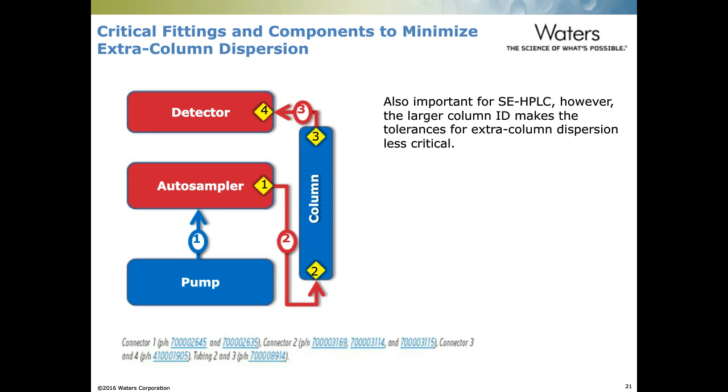On the other side, much like any other chromatography separation, we are concerned with the dispersion in the detector, as well as the quality of the connectors between the detector and the outlet of the column. So it's important to set these experiments up correctly and to make sure that our connections aren't adding any extra dispersion to our separations, to get reproducible results.